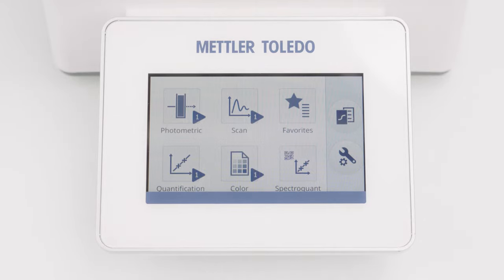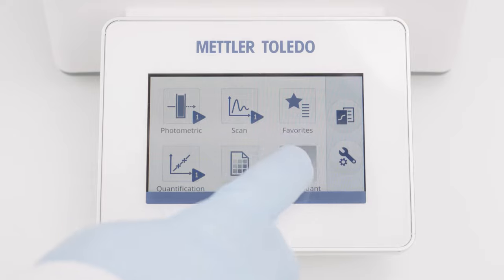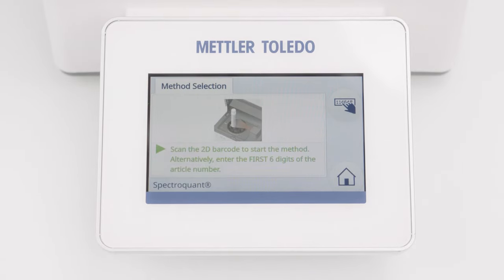Let's start with the first test kit. Click SpectreQuant on the home screen. This activates the SQKit reader. To enter the method, I have to scan the barcode on the test tube.